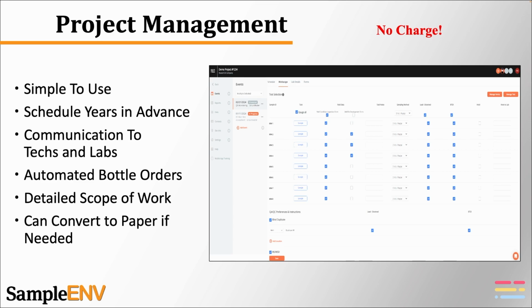We have the optional ability to generate paper forms for those that are nervous about going cold turkey on the use of paper. We created the ability for users to run paper forms parallel to the digital process. This is for new users nervous about switching to digital. It's rarely used, but available to anyone that feels the need.